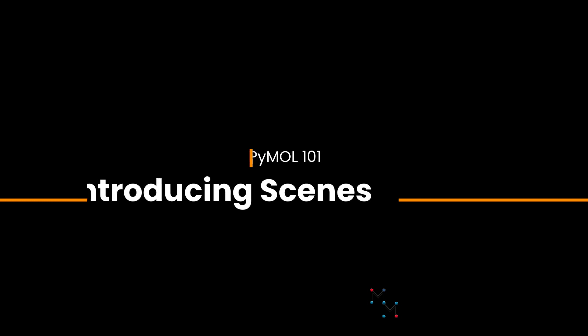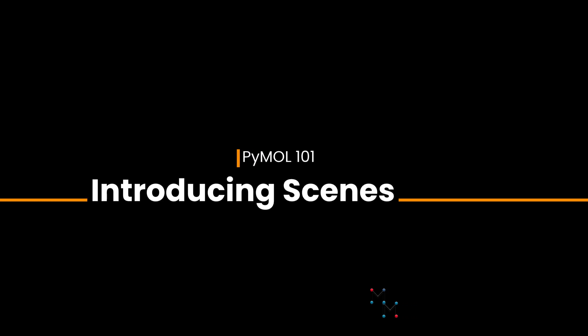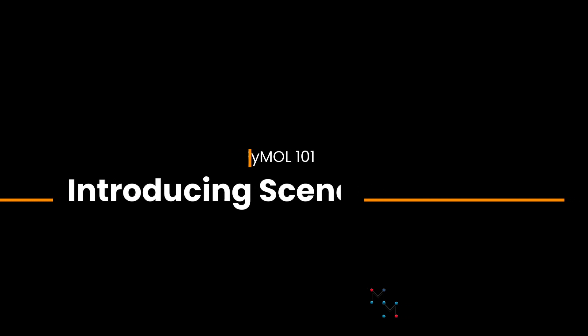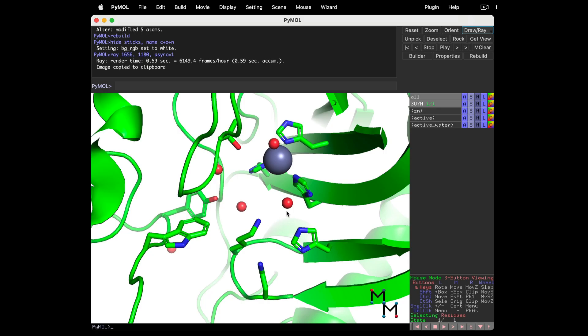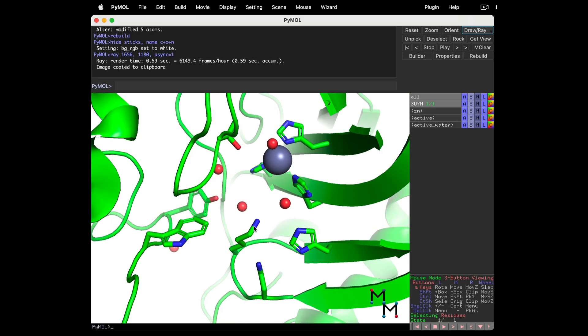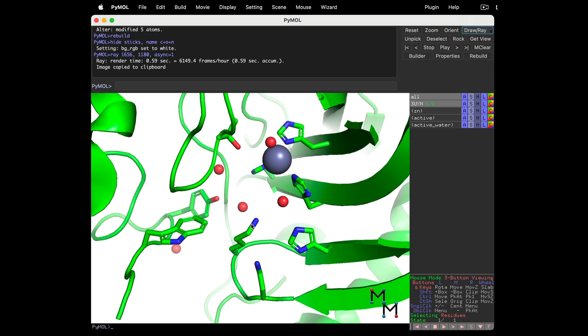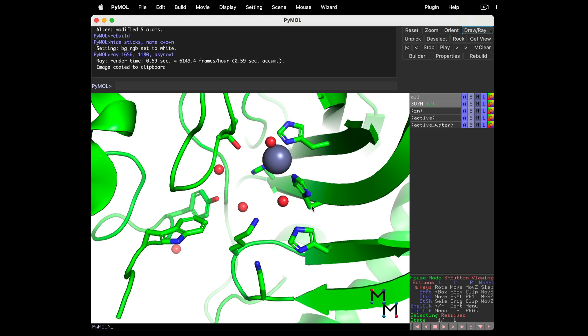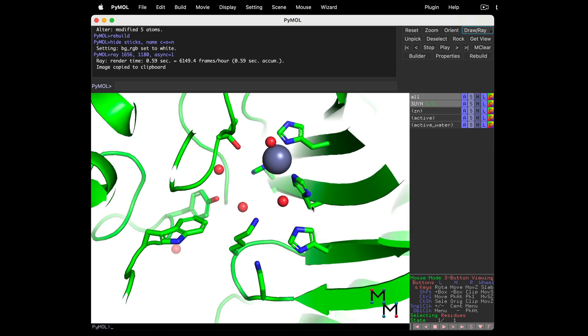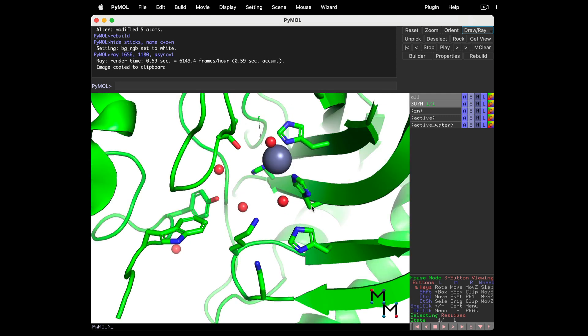Not to be dramatic, but the day I learned to save scenes revolutionized my PyMOL modeling experience. It is so easy to misclick and mess up your structure, and scenes give you a quick and easy way to go back. Every time I like the way a structure looks while I'm modeling, I save a scene.